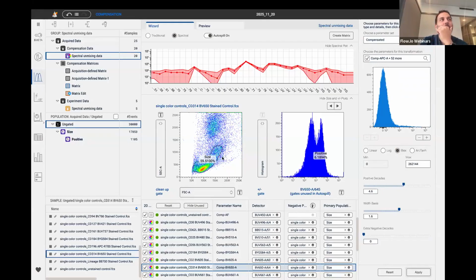But from matrix to matrix, I'm not really sure, if I'm honest. Like we did with drag and drop in version 10, right? I don't think it's possible. Thank you, Sebastian.